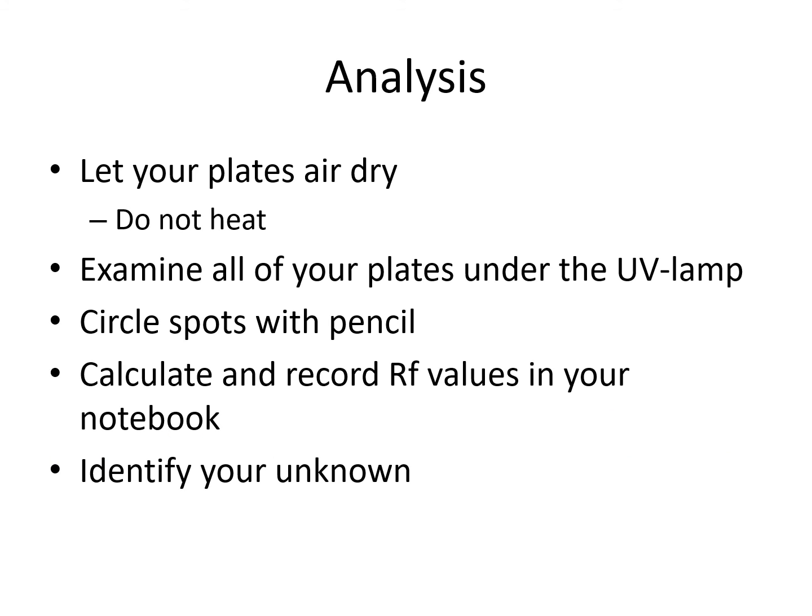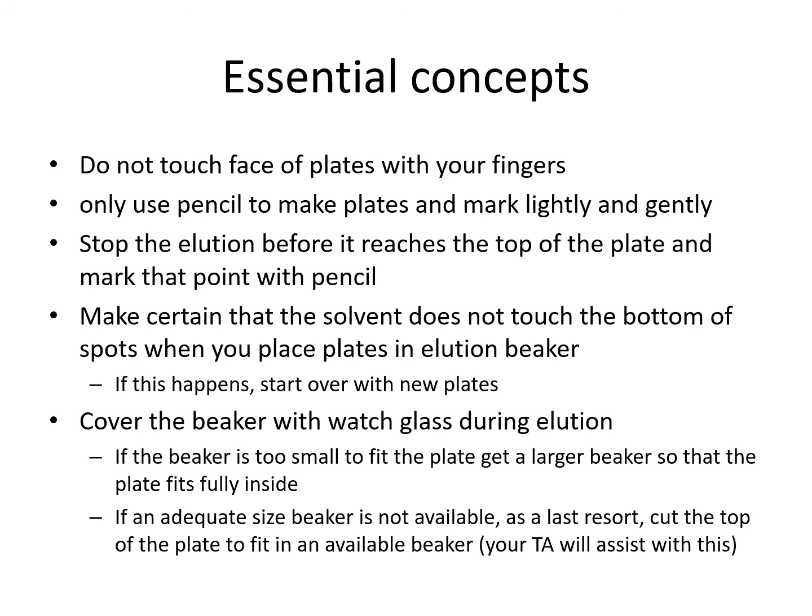So how do we analyze this? How do we analyze the thin layer plates? After the experiment, for comparison or identifying of samples, in addition to the visual identification, we calculate RF values. How do we calculate the RF value? The same way we discussed it in the earlier slides.